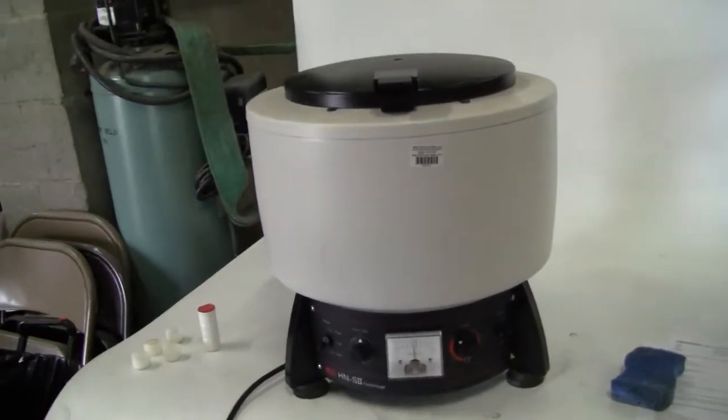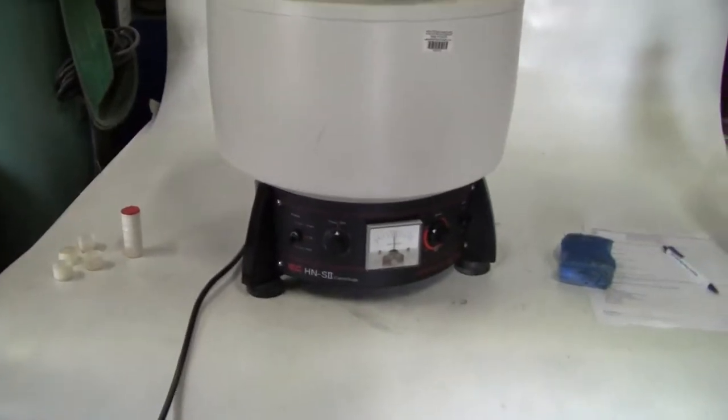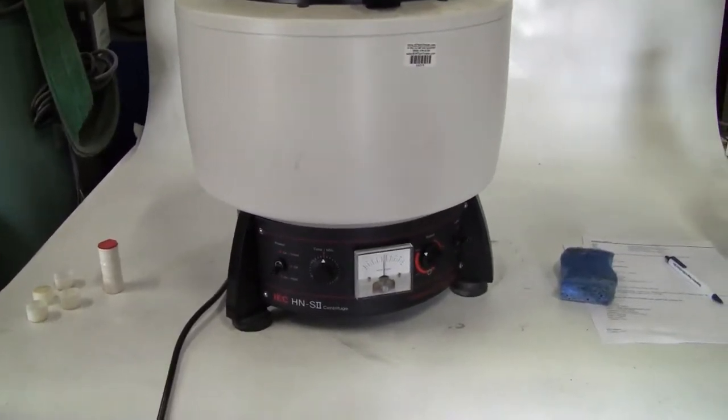Hi, this is Michael Naitow from Hi-Tech Trader. Today we're looking at an IEC HN-SII centrifuge, a classic centrifuge.